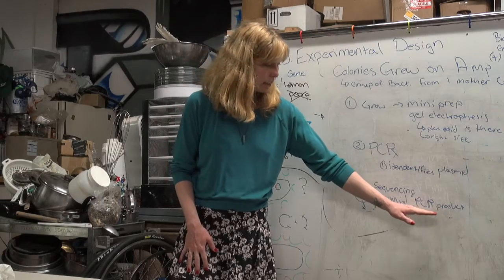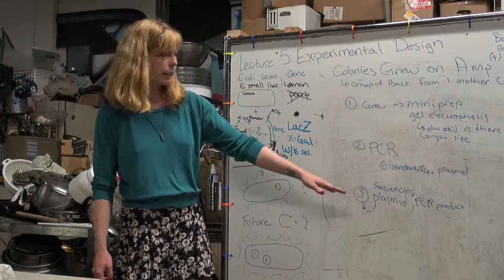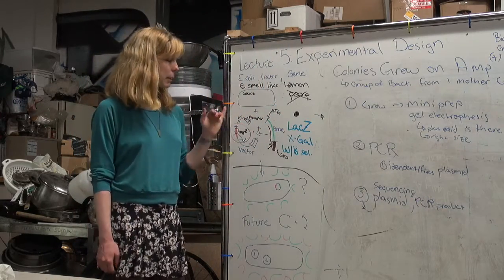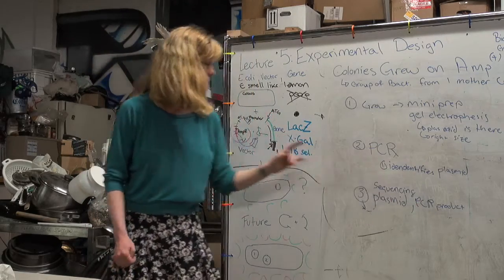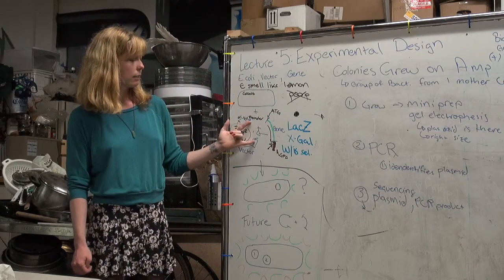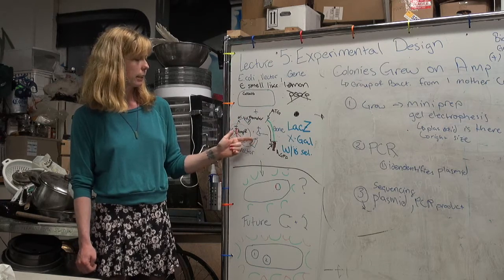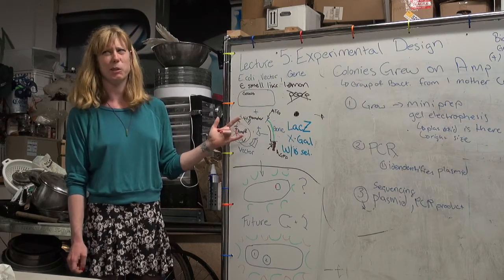But generally, what I would do is look at my PCR product. I'm pretty sure that if there's something else really wrong, I'd see it when I get my plasmid sequenced. But your PCR product will be delimited by your two primers, so it'll sequence this way and this way. Sorry, I was pointing up here when I was talking about sequencing your whole plasmid.